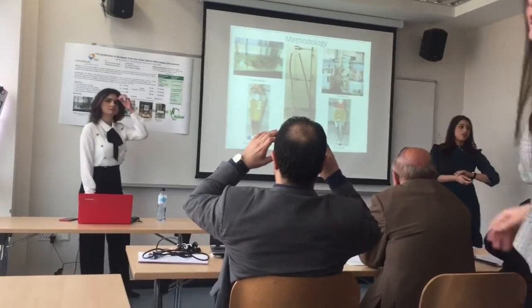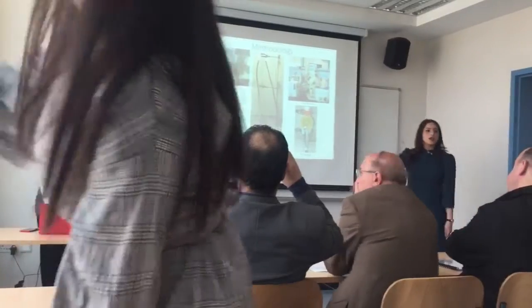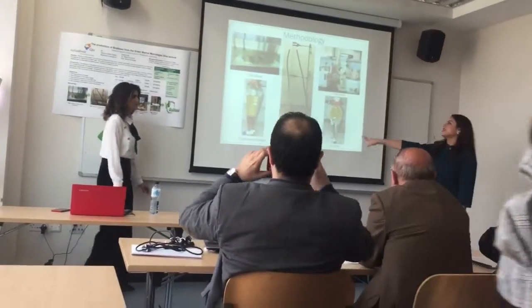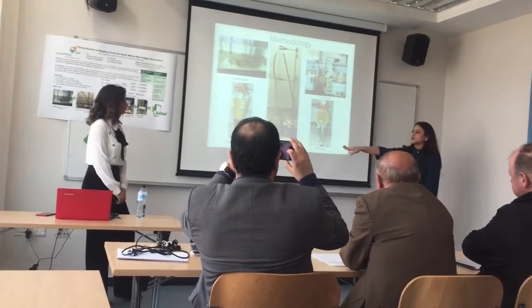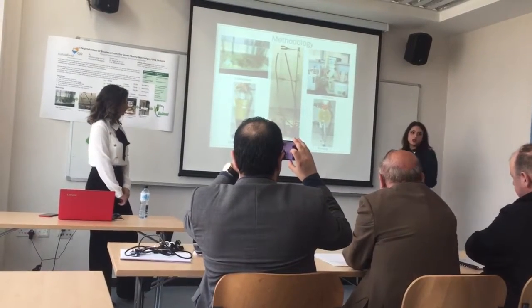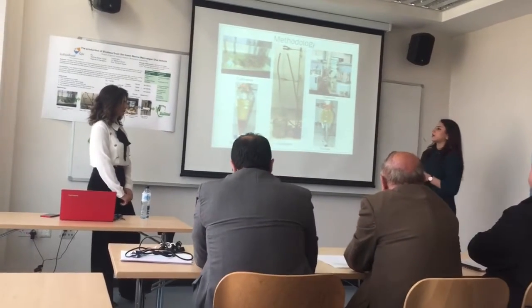So here's the methodology of our procedure. Our methodology involved multiple steps. First, we had to cultivate the algae, extract the algae oil, purify the oil, carry out the transesterification reaction converting the oil to the biodiesel, and finally separate, wash, and purify the biodiesel.